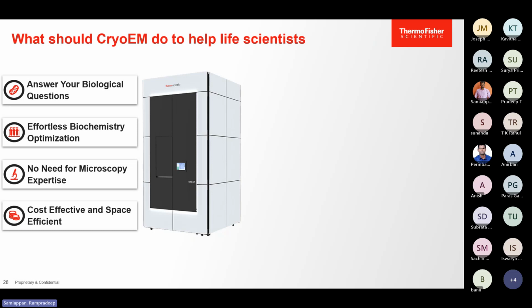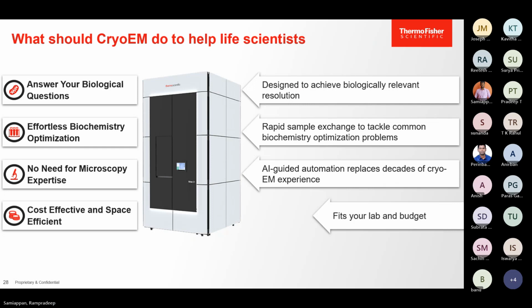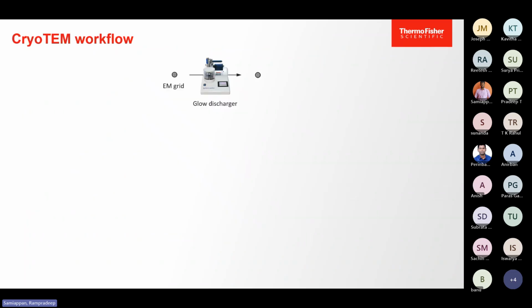And that comes to the research. So your scientific knowledge plays a very important role in preparing the samples. And once you get a very good sample, then you have equipment that can take care of the rest. But the background and backbone lies in the sample of interest. The sample should be in a very good quality. Let me go through cryo-EM workflow.